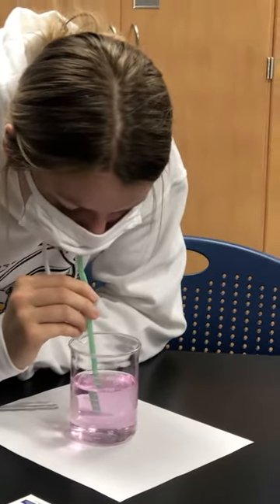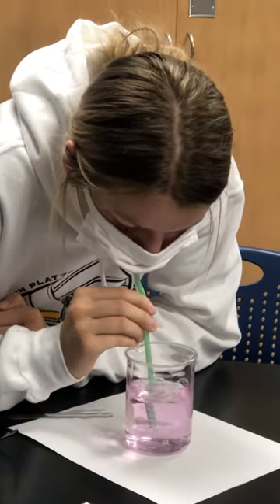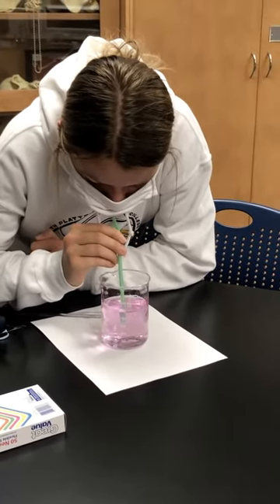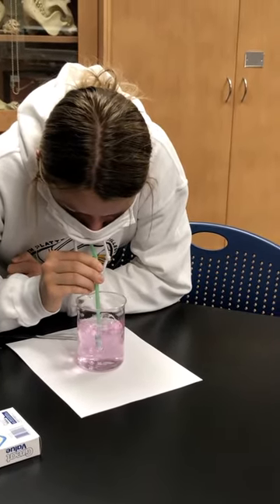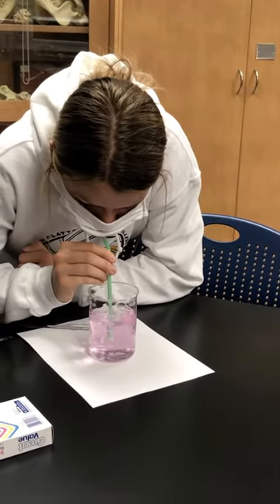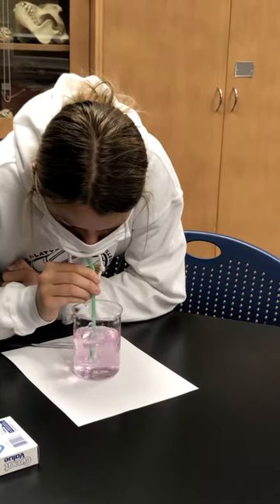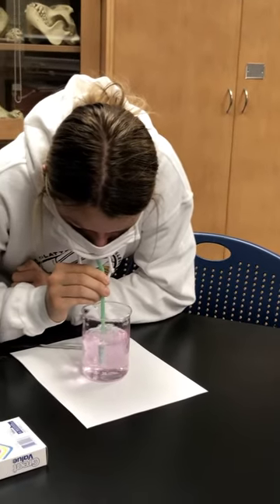And she's going to continue to blow out, which is exhaling that carbon dioxide. As she does this, what we're going to see is a gradual color change. This solution originally started a very deep pink color. It turns bright pink in a basic solution. As this solution becomes more and more acidic, it's going to become colorless. So that carbon dioxide that Allison is exhaling is forming carbonic acid in the water. So in turn, that carbonic acid is neutralizing the basic solution.